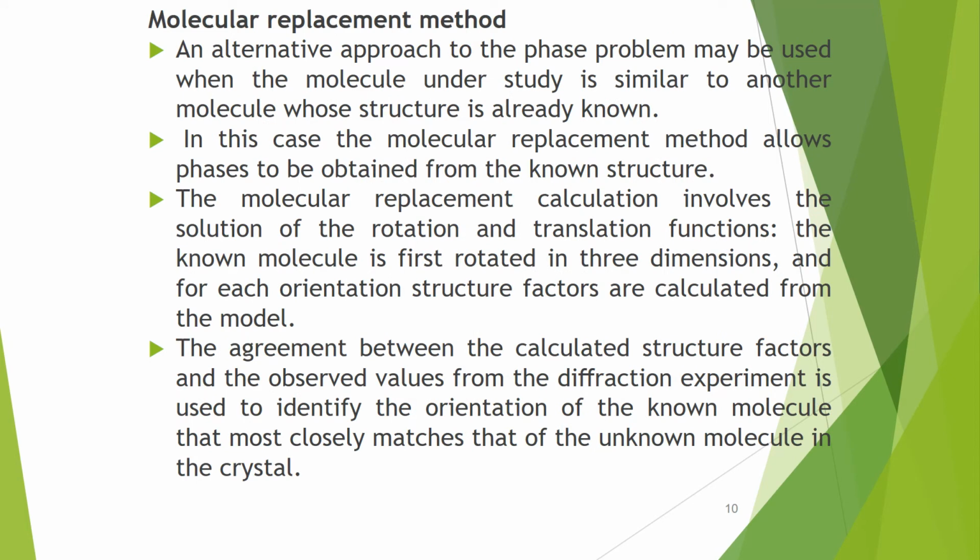Second is the molecular replacement method. In this method, an alternative approach to the phase problem may be used when the molecule under study is similar to another molecule whose structure is already known.